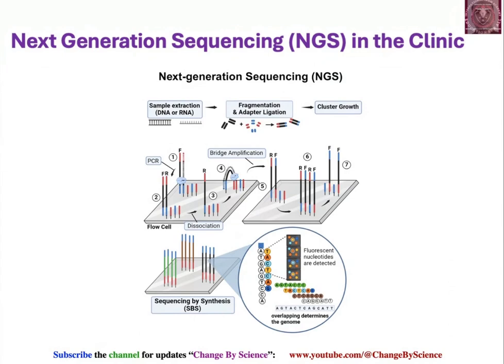Hi, today I am going to present the basics of next generation sequencing and their application in the clinical purpose. So, as you are aware, since the last one decade, NGS is one of the most demanding applications for biological and clinical research. So, this lecture will cover the basic background about NGS and its applications, especially in clinical purpose also.